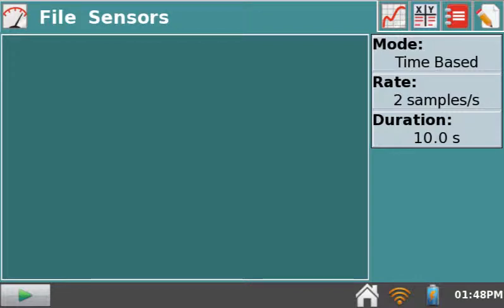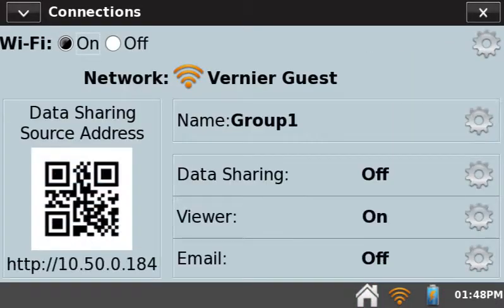To enable data sharing, tap the Wi-Fi icon located in the lower right corner of the screen. This launches the Connections app.